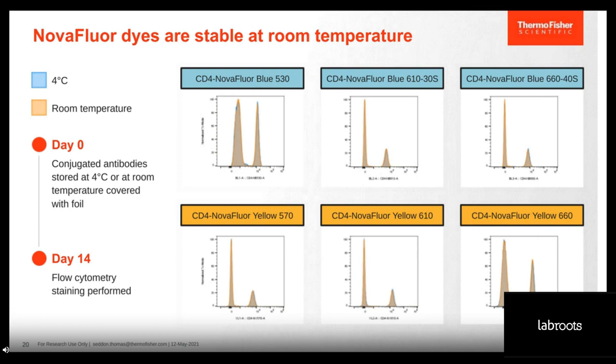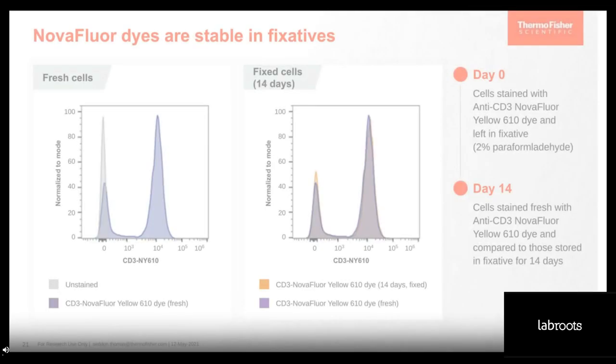And what you can see here, I like to think about this sometimes as the absent-minded graduate student experiment, because I certainly have dealt in my days with someone forgetting, leaving the antibody out. And even if you leave it out for these 14 days, you really don't see any differences between what's happening at room temperature or 4 degrees. And so not only are they consistent, but you can see that they're stable over this extended temperature incubation.